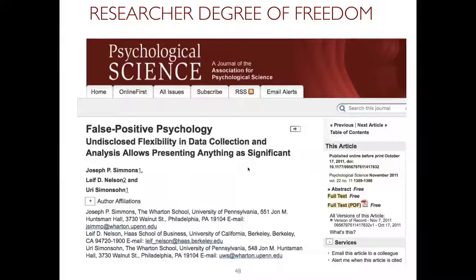It means that we need to work with data sets like this, example data sets, control mixtures, to understand the limitations of different workflows, including the sample size, the filtering, and data processing, and essentially establish the SOP, which we will follow in the next study, and then stick to this SOP. And if this SOP gives us a p-value which does not pass the threshold, well, so be it, right?